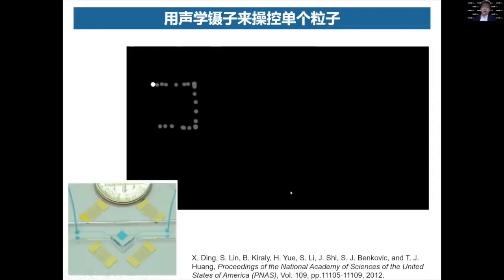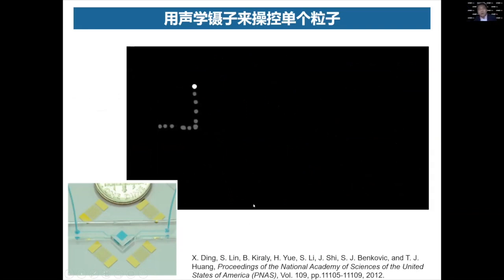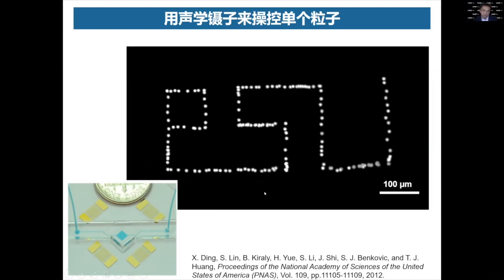We can also use our tweezers to control a single particle, a single cell. Imagine we inject a sample solution with cells or particles into a microfluidic channel, and we turn on the acoustic wave. We turn on the voltage, the acoustic wave is on, and then we can trap a single particle, and we can move it. Now I'm a professor at Duke University.